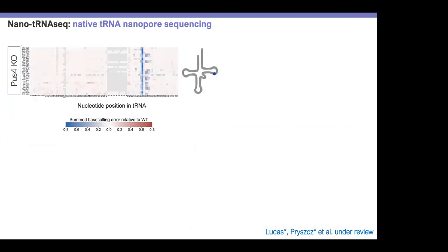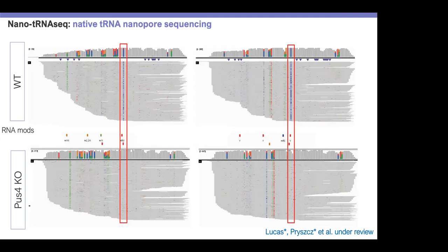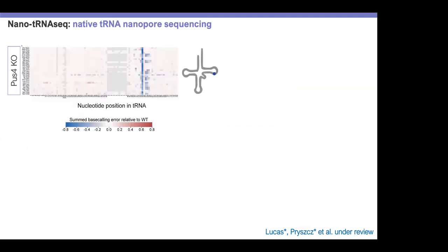So if we look into this in an aggregated mode, before I was showing just one tRNA and all the individual reads mapping to it. Now let's look at this track and compare knockout versus wild type, so let's subtract this coverage track minus this one. What I would expect is to see the differences in errors between one and the other, and now I do this for all the tRNAs and aggregate it. What we can see is that in the PUS4 knockout, all of the tRNAs, when I compare PUS4 to wild type, have the modification, because I see a consistent perfect line in this position, meaning that really all of the tRNAs are modified by this enzyme. Figuring this out in the early years would have been a lot of biochemical work testing individual tRNAs one by one.